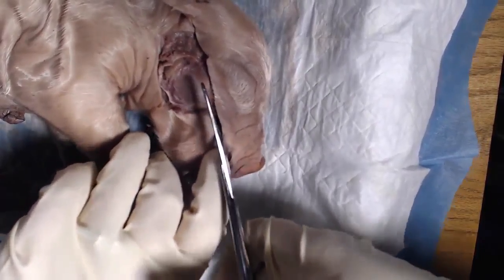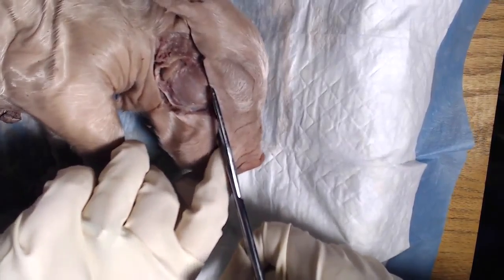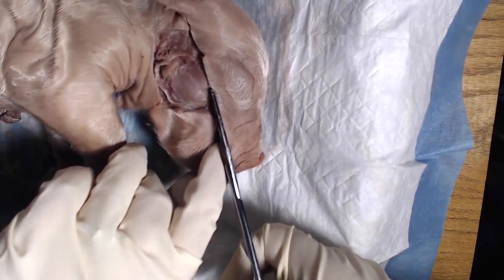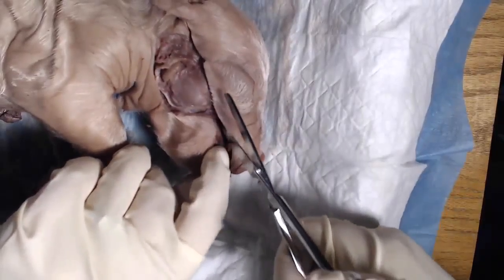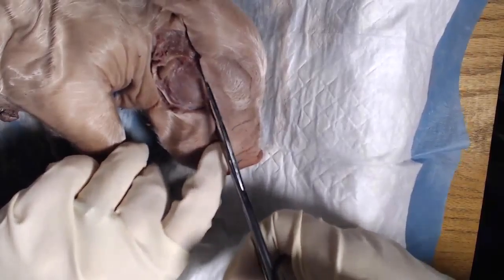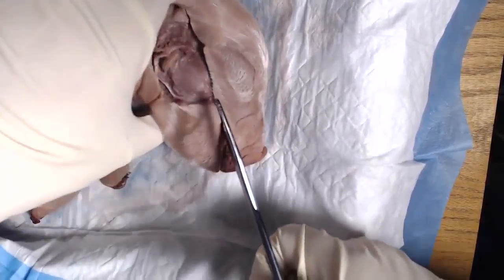Now you want to get basically under your masseter and the mandible, because we're going to be cutting through the bone. So you are going to have to put some muscle into this cut. But if you're using scissors like mine, you should be able to cut through the bone, no problem. So go ahead, and you're still aiming towards the ear, the pig's ear. That's the trajectory you want.